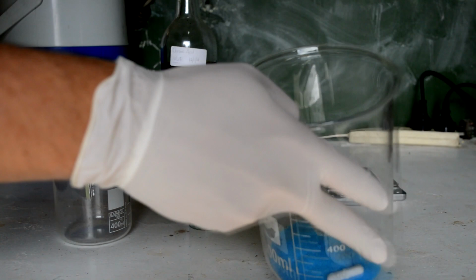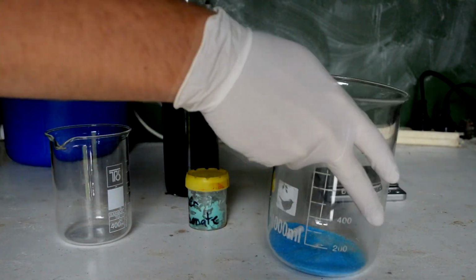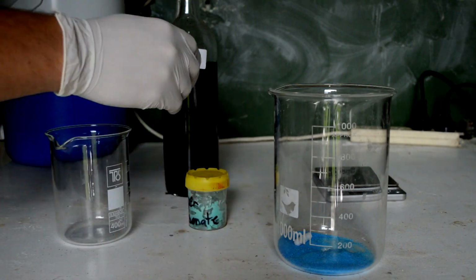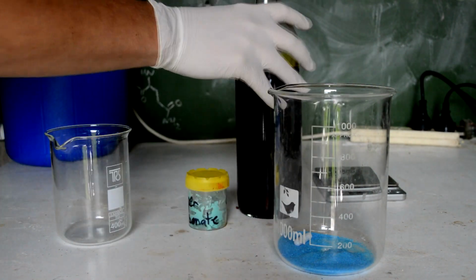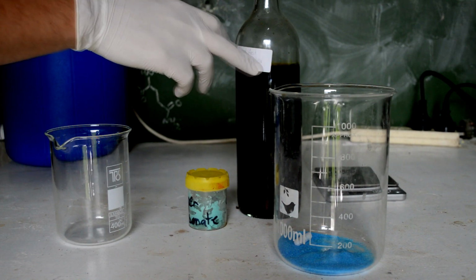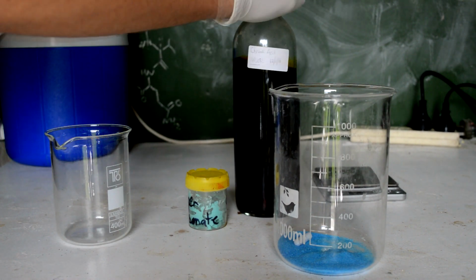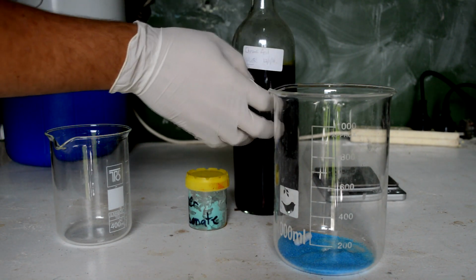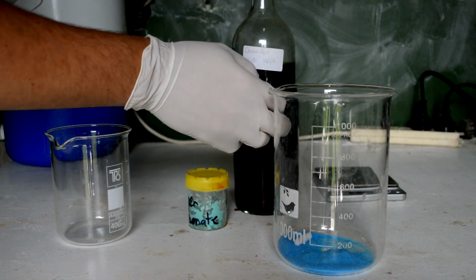So I have 23 grams of copper sulfate here, and we're going to dissolve it up, and then we need to add some ammonium chromate to it. What I have here is some waste hexavalent chromium from the 12th of January 2016, according to its label. We're going to get some of this and just basify it with some ammonia.